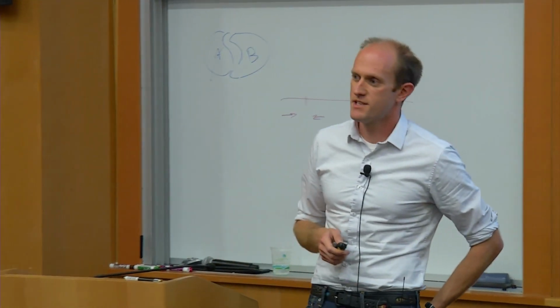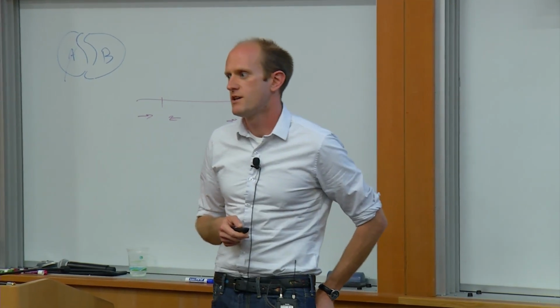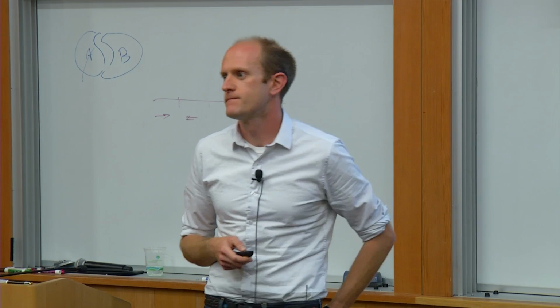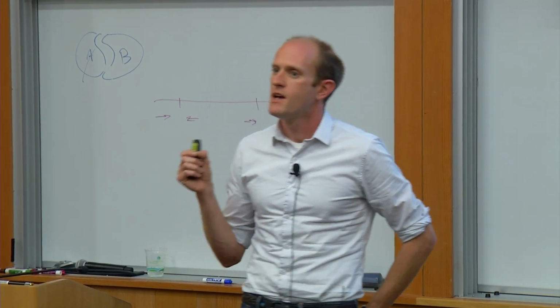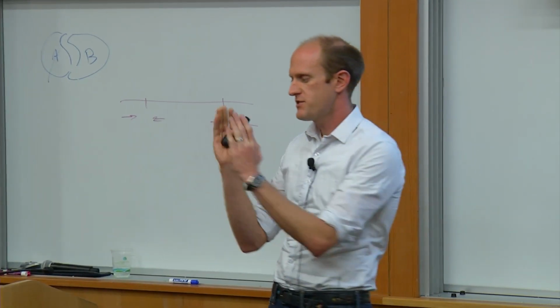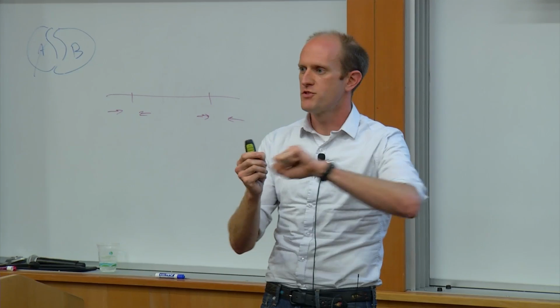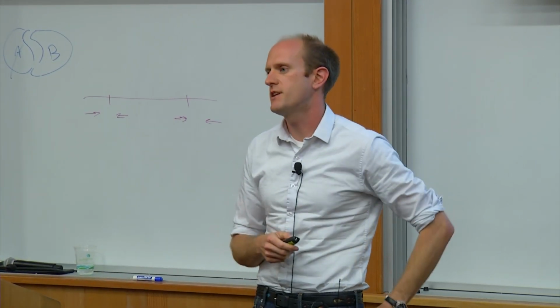So the question is, is the data generated from a lentiviral library? Yes, this is all lentiviral, so this is where you infect guides. And it was just based off of the top 25% most active? Yep, top 25%, where activity is defined as you have a surface expressed gene, and then you look for loss of that surface expressed gene. Then you sort based on now marker negative cells and sequence those guides from the lentiviral library.